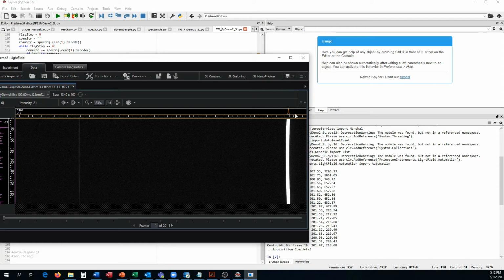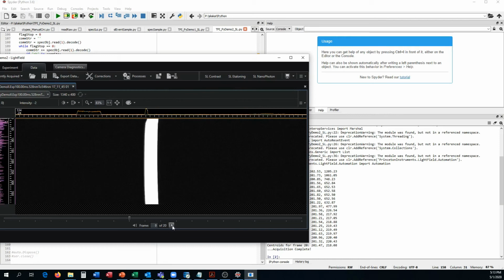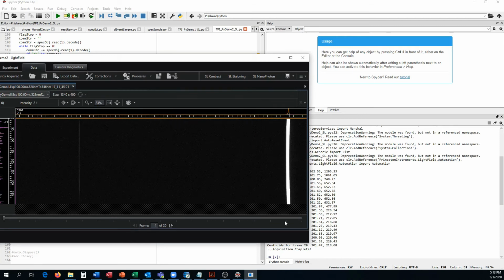So the dispersion from the grating in the vertical direction is covering the entire image sensor in this case, all the rows. So the centroid is going to be somewhere around the middle. Again, we have 400 rows, so you would expect the centroid to be around 200 something. So it's really not shifting. We go through this, and see, the vertical positions are filling up the entire sensor.